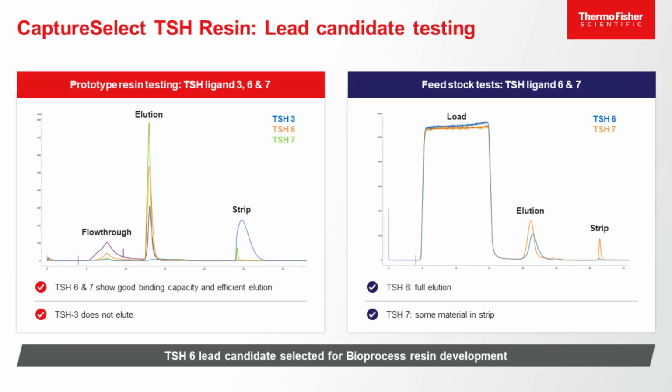In this case, I'm going to only focus on the latter stages of the program in course of time. But this is actually where we picked it up in work package 3, right? As you can remember, in work package 3, we have about 6 candidates, in this case showing the data of 3 of them, which were TSH ligand 3, 6, and 7. And this was actually tested by ourselves and by Genexine.